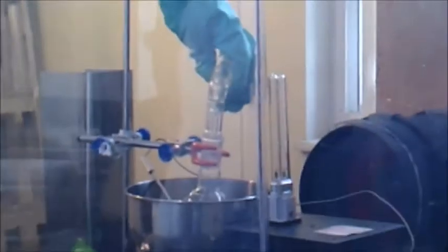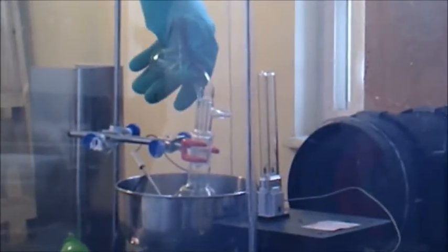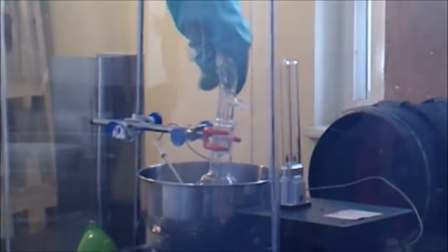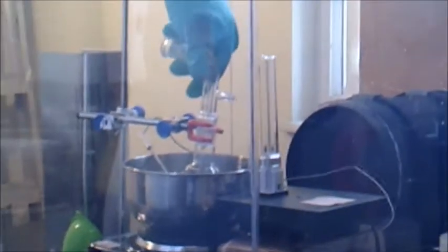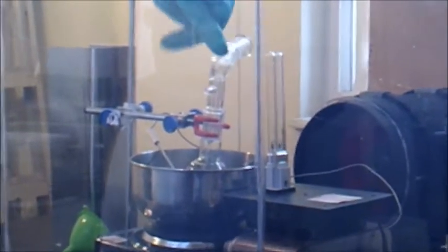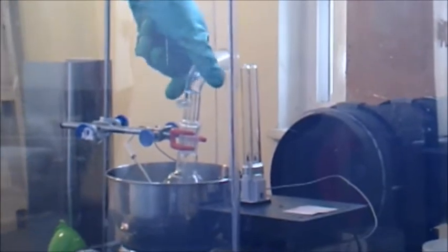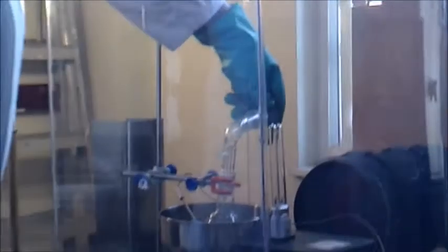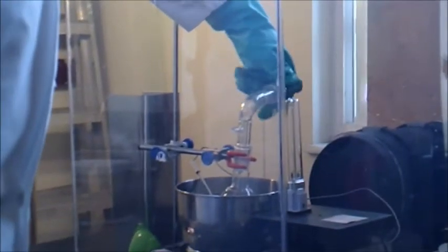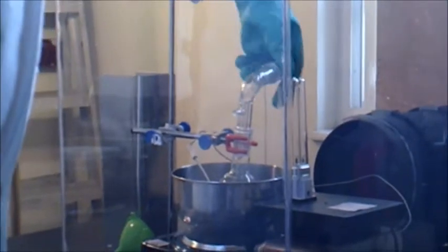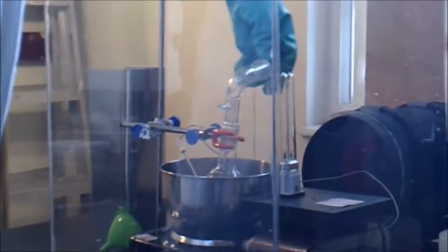Alright, so now I'm going to fit the round bottom flask with a fitting which will allow any vapors given off to be directed towards the fan in the back. And I'm going to attach a stopper to the fitting so that there's only one port where the vapors can escape.